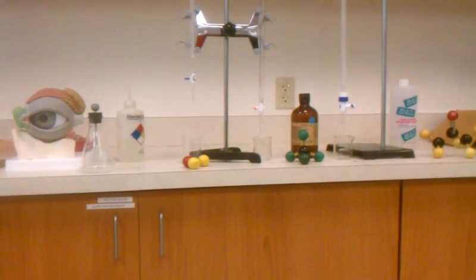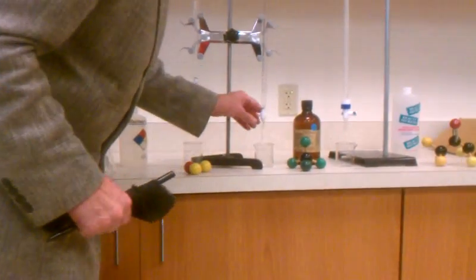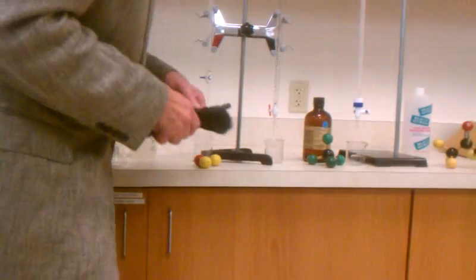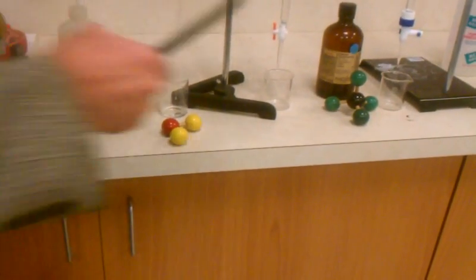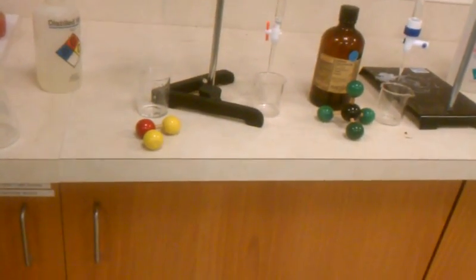So when I make my stream of carbon tetrachloride come out of the burette, and I picked the burette just so I could have a little fine stream, then well, nothing should happen in this case. So nothing happening is not a big exciting thing to see, but you see, I can't divert the stream with the rod at all, and yet look, I do have electricity, and nothing.